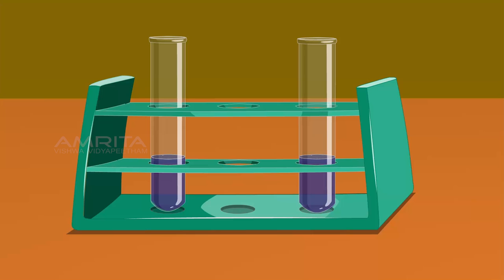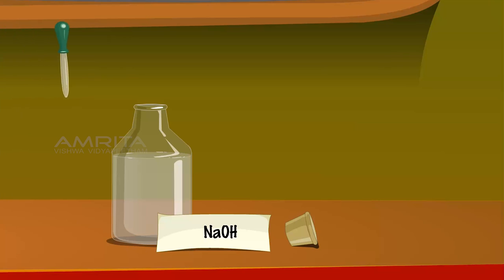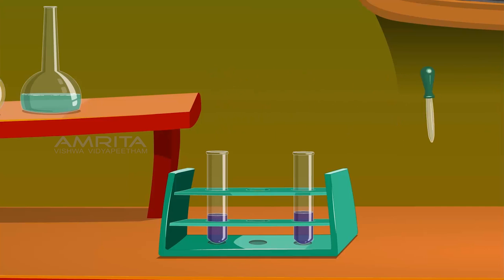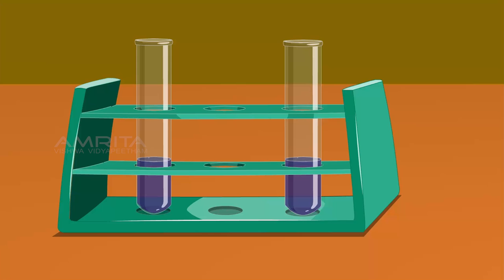NaOH is an alkali with a pH more than 7. Take a few drops of NaOH solution from its bottle using the dropper and add it to the test tube containing the blue litmus solution. The colour of the solution remains the same.